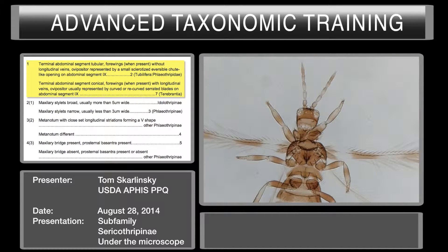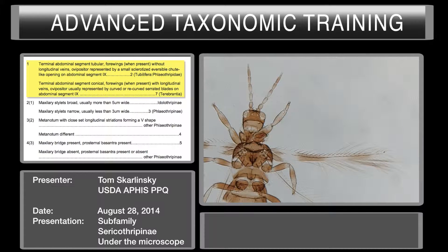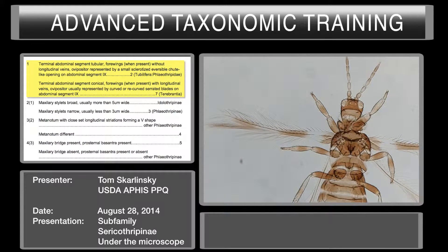Now let's go ahead and take a look at the four wings. We can pretty much see there's a nice row of venal setae. We've got nice longitudinal veins with setae on there.